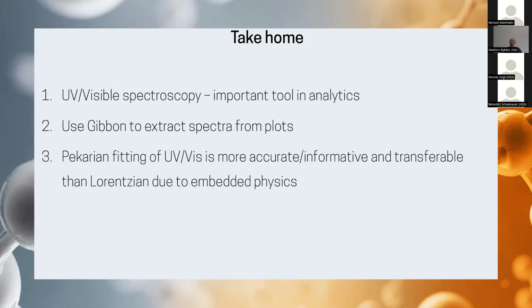And finally, fitting functions to more physical models, which is actually a new trend, can allow retrieving compact and physical representations, which can be recycled for further chemometrics or chemical analysis.